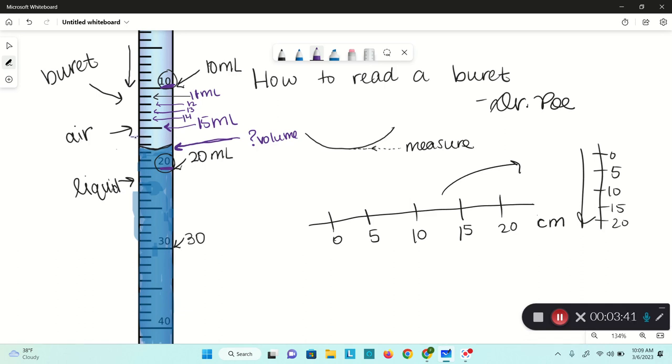After that would be 16, 17, and if we zoom in even closer, between 17 and 18, that's where the meniscus is. Now we need a number between 17 and 18. The bottom of the meniscus is right here, and to me that looks like it's a little bit more towards 18 than 17, like a little bit more than halfway. I know this is going to be maybe a little bit more than 17.5. So my guesstimation is going to be 17.7 milliliters. If you said 17.6, you wouldn't necessarily be wrong because the last digit is your estimate.